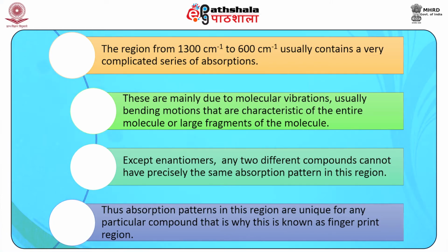These are mainly due to molecular vibrations, usually bending motions that are characteristic of the entire molecule or large fragments of the molecule. Except enantiomers, any two different compounds cannot have precisely the same absorption pattern in this fingerprint region.